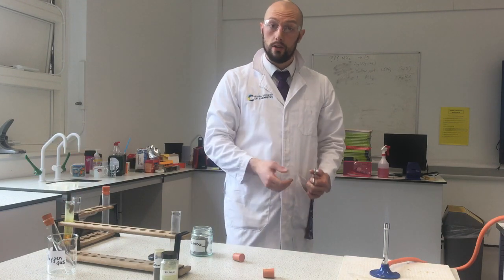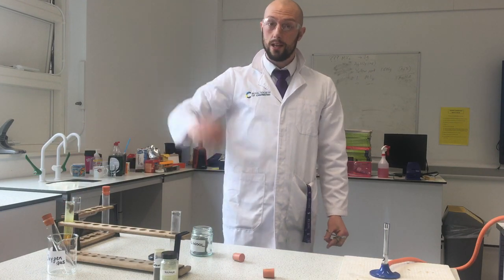So that shows us that oxygen is more reactive than sulfur. As you go up group 6, it gets more reactive.